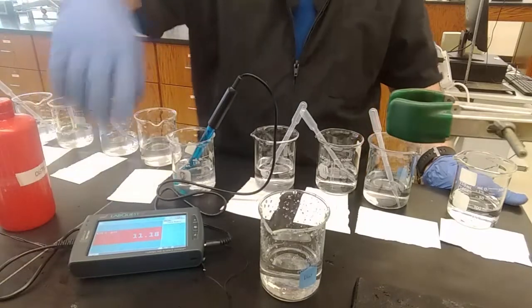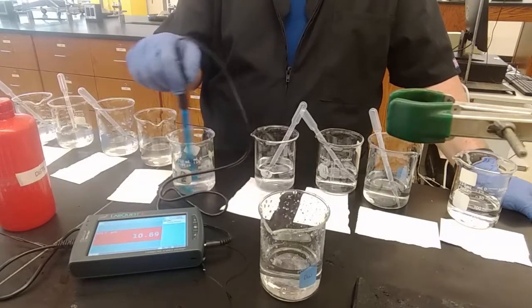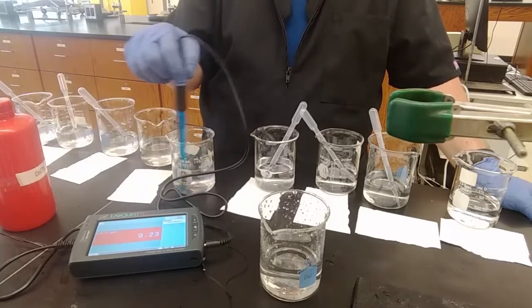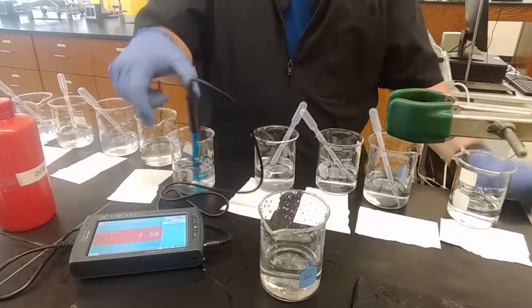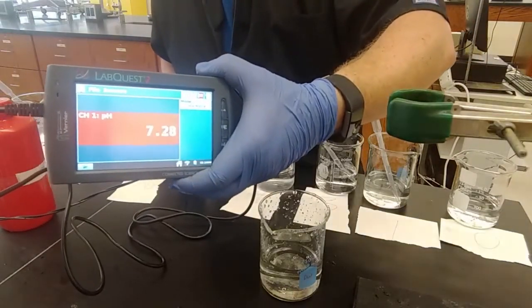Dropping down from where we were at 14. Again, this is not immediate like the spectrophotometry. We're dropping through 7 now.